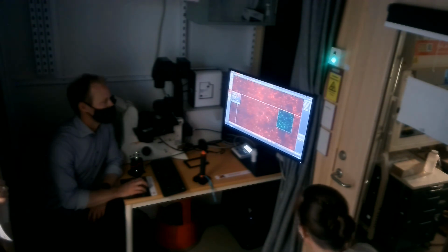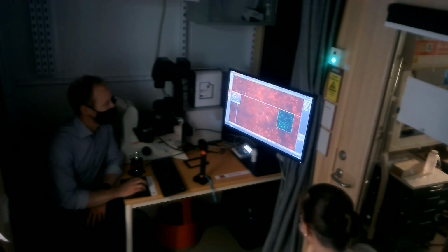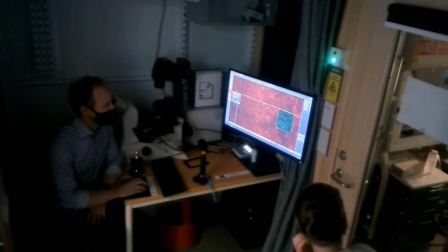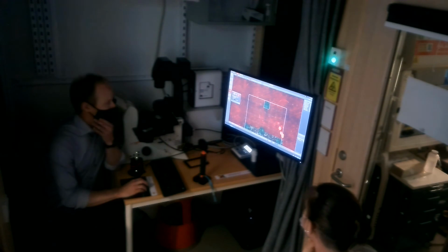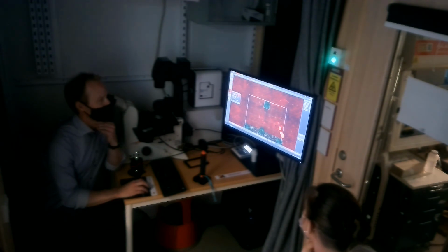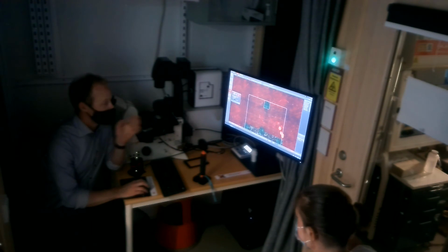That's basically showing you which positions it will do an autofocus job. Right now it will do it in the first one, then 2, 3, it will do it in the fourth one, 5, 6, and then it will continue. So that's one way you can set this up. Now we will do an autofocus job every third frame to keep it in focus.